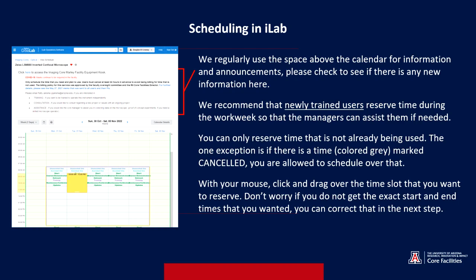Once you get pretty confident, then nights and weekends are great. I will say that there are a couple of microscopes that have less expensive weekend rates, not all of them, and you'll need to inquire about those. On the calendar itself, you can only reserve time that's not already being used.